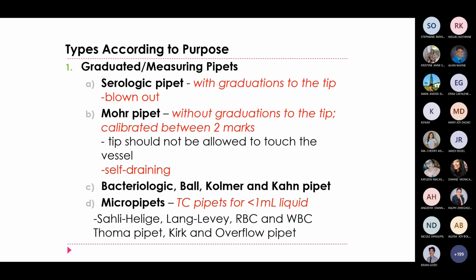So, for serologic pipette, the graduations are up to the tip. So, isa pa siyang blown out pipette. Again, pag blown out pipette, may etched rings. And tandaan n'yo ha, sa mga matagal na ding panahon, hindi tayo gumagamit ng pipetting by mouth. So, dati pang era ito.